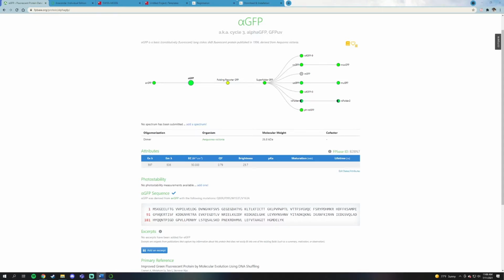Hello everybody. Today I will be giving you a tutorial on how to use SaliLab's modeler to take a protein sequence with no crystal structure and compare it to a known crystal structure, and using Python we will create a suggested crystal structure for your unknown sequence.